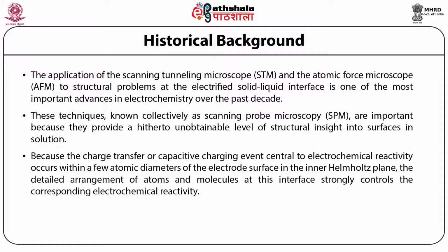Because the charge transfer or capacitive charging event central to electrochemical reactivity occurs within a few atomic diameters of the electrode surface, in the inner Helmholtz plane, the detailed arrangement of atoms and molecules at the interface strongly controls the corresponding electrochemical reactivity.